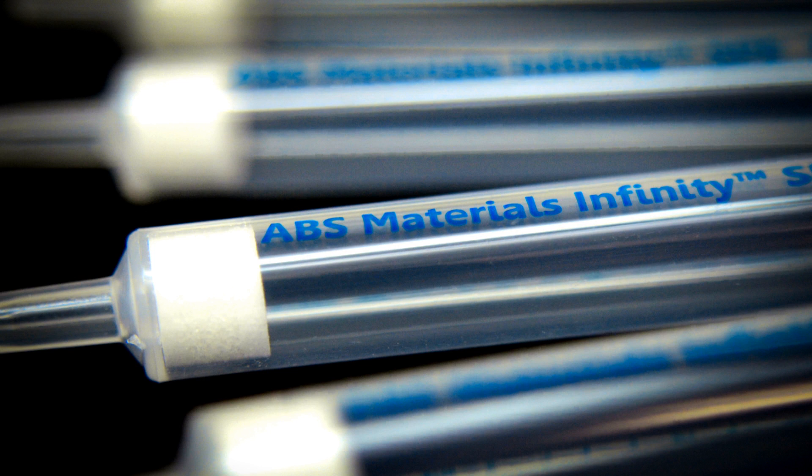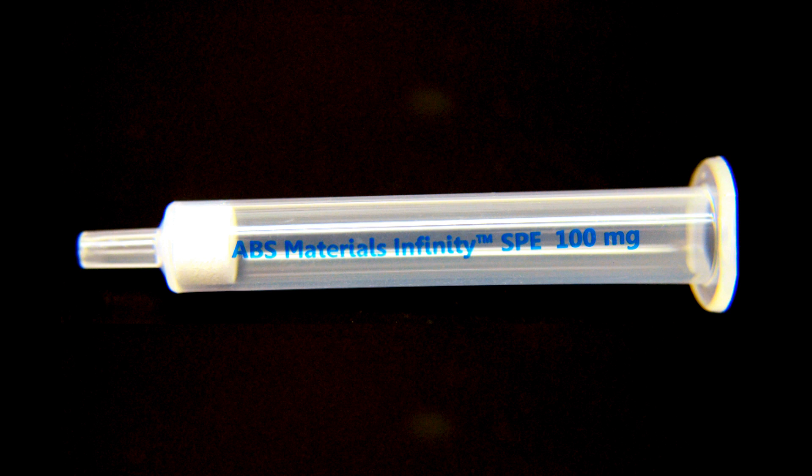The Infinity SPE cartridge is compliant with EPA method 3535A and all affiliated solid phase or liquid solid extractions, including methods calling for C18 or divinyl benzene medias.